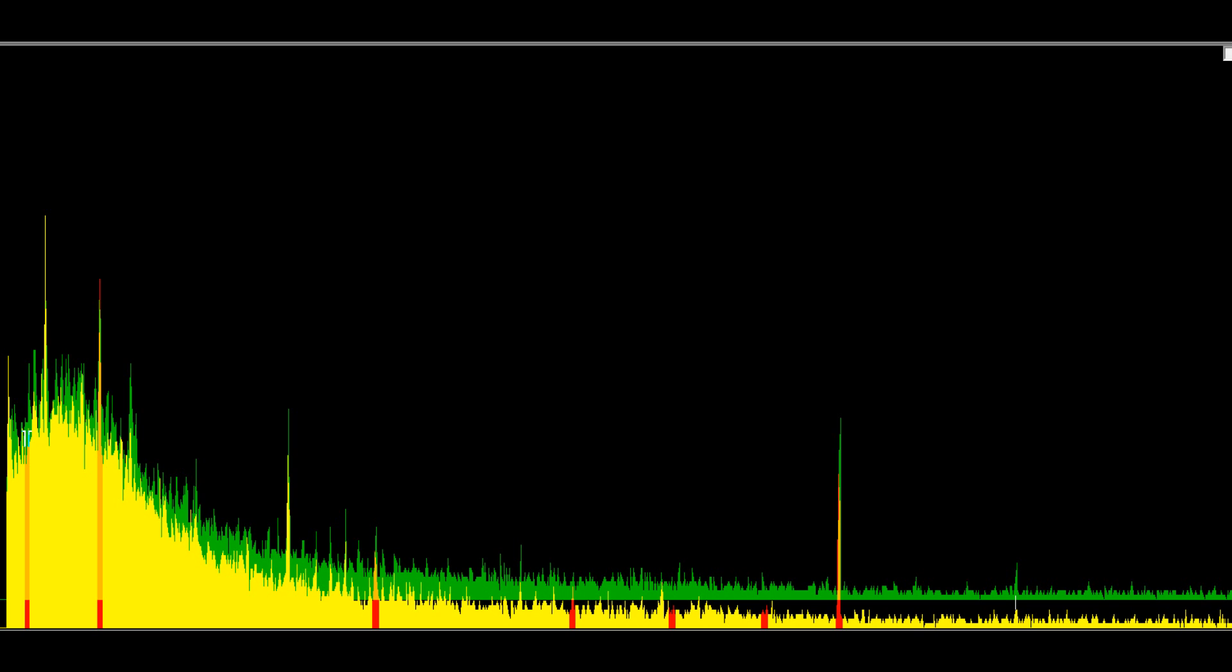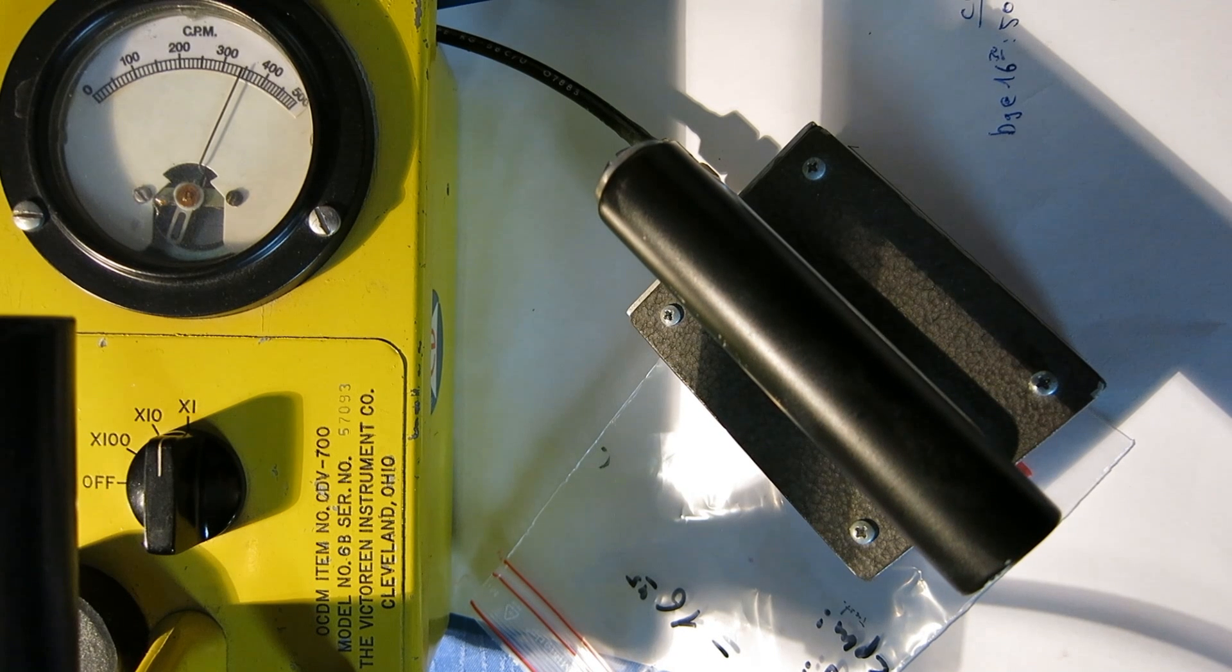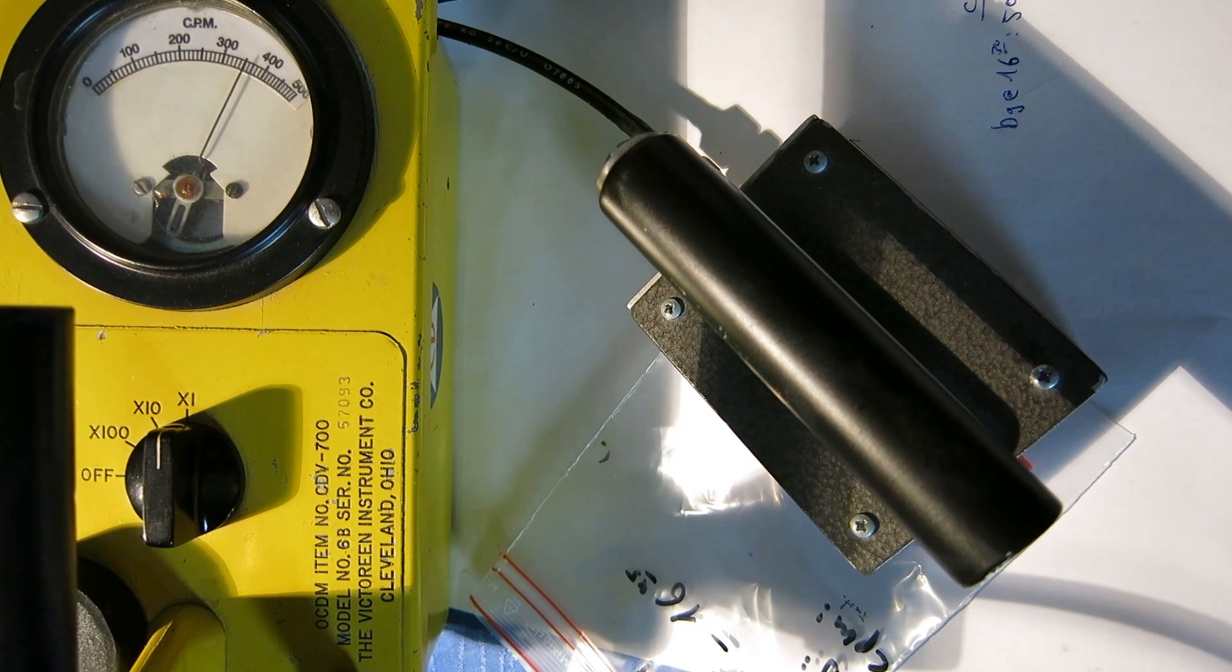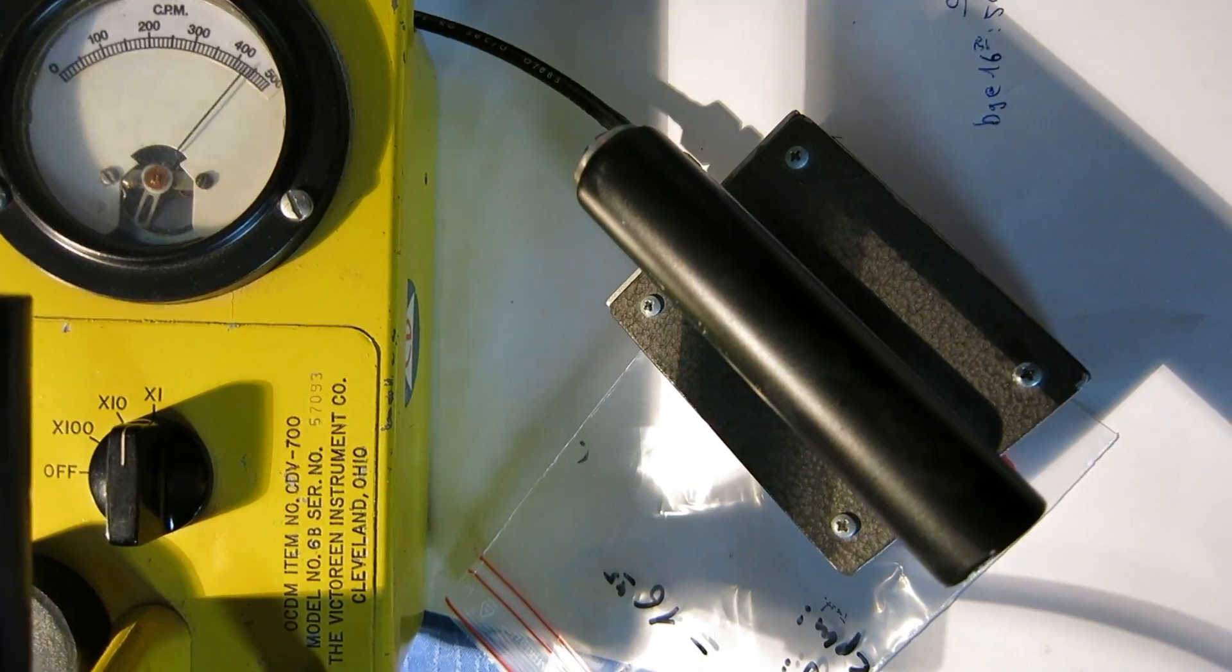And as you probably expected, the same goes for the spectrum I took of the balloon that I measured around midnight, which was less radioactive to begin with, but now except for some natural fluctuations there's nothing special in there. It's pretty much background radiation. So whatever is in there in terms of radioactive must be decaying quite fast.